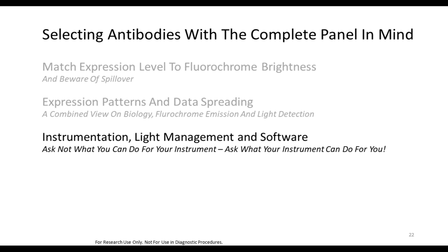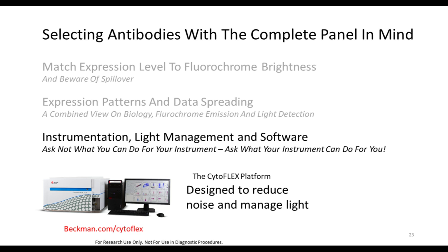Traditionally, I think it's okay to say that we've had to think about our instrumentation as what constraints it puts upon my experimental design. With the newer technology, and specifically we're going to talk about the CytoFLEX, I think it's fair to say that you can ask a different question now. You can ask, what can my instrument do for me to help make my life easier, help make my panel design maybe a little bit simpler?